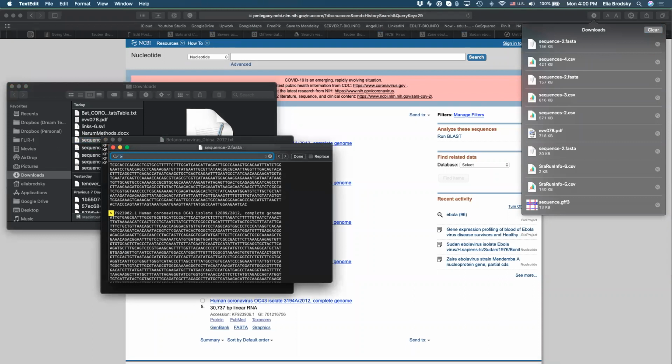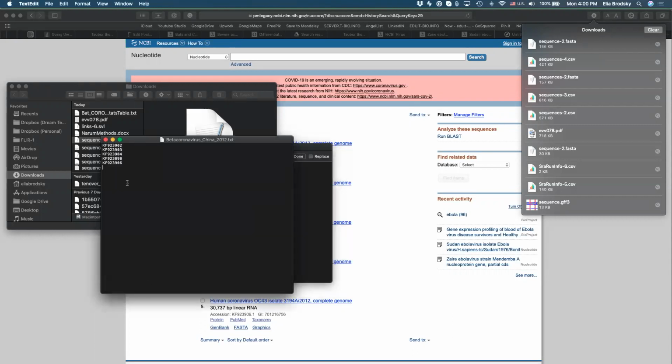One is based for exploration, when you're exploring it on a database and you want to validate everything right then and there. But once you kind of know what you're looking for and you have many of them to deal with, it's much easier to download the table, select the ones that you want, organize them into a single file, right? Instead of 5, again, you could have 25 here and download all of them at the same time.